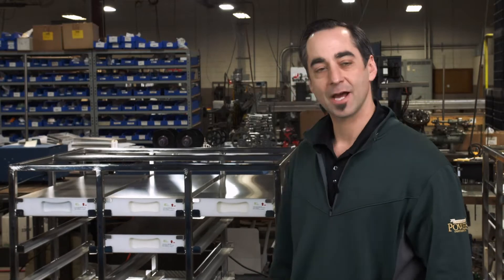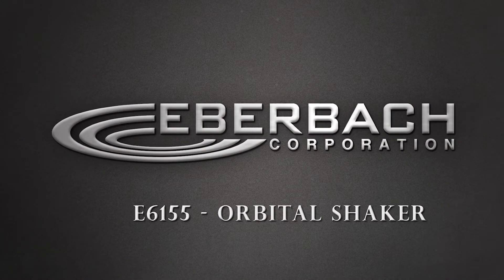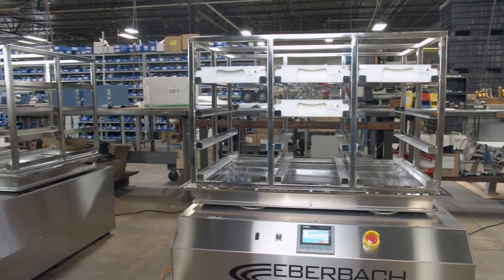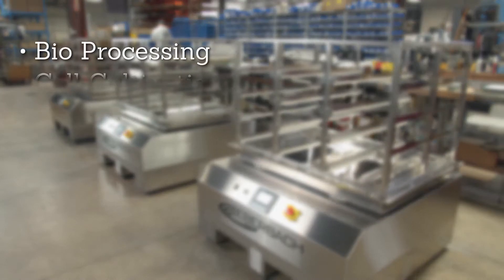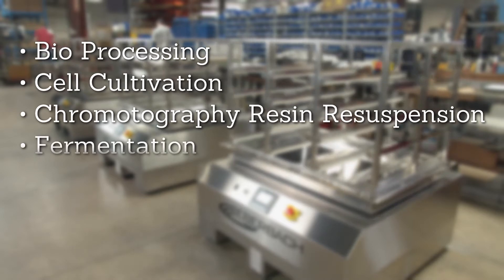See you right here in action. The 6155 Shakers are used in a variety of applications, spanning from bioprocessing, cell cultivation, chromatography, and resin resuspension.